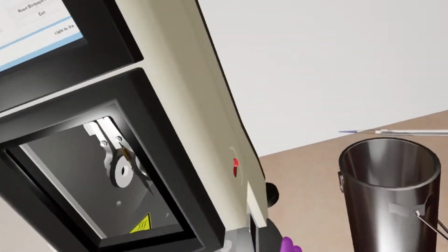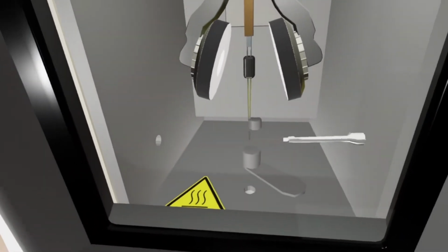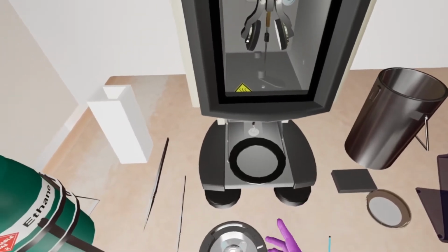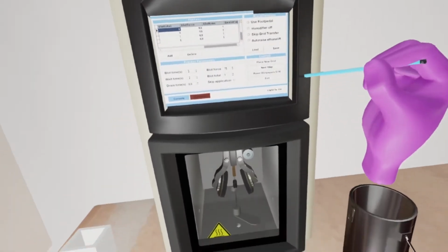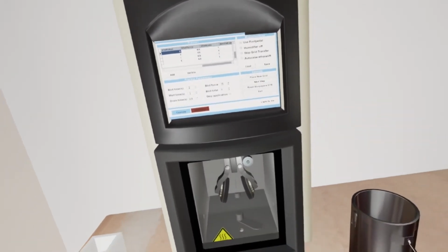Open the side port on the right side of the Vitrobot. Use the pipette to touch the grid at the bottom of tweezers through the side port. Grab the workstation and put it on the workstation platform. Use the stylus to press Continue on the Vitrobot screen to start blotting. Press the button for the operation.